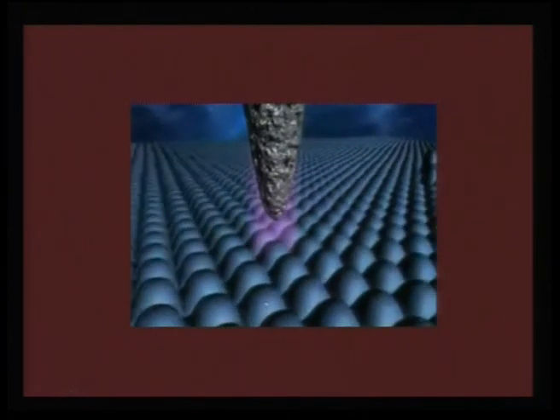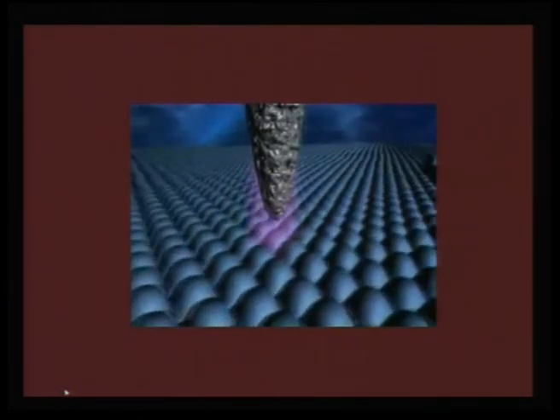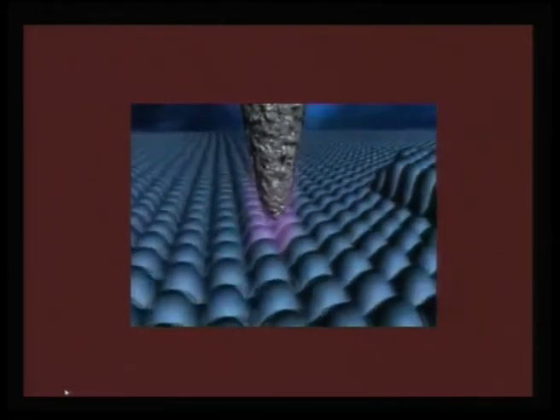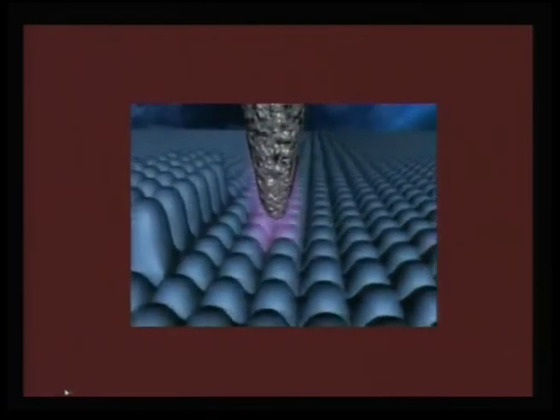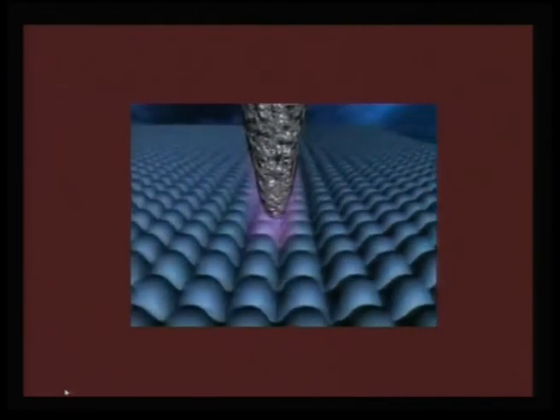And as you would see here, there is a tunneling that is achieved between the tip and the surface, and this can map. If there are any edges or steps, the tip can actually adjust itself to probe. Therefore, in a predominantly flat surface, any corrugations or any step edges that are there, everything can be mapped once you achieve a tunneling probability.